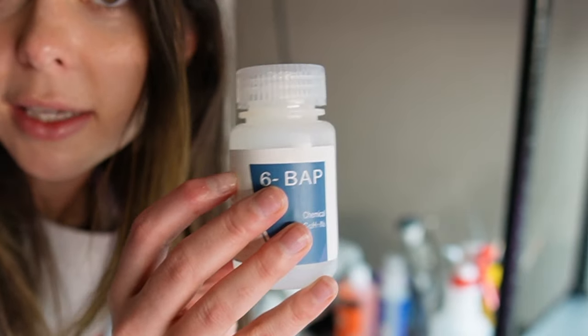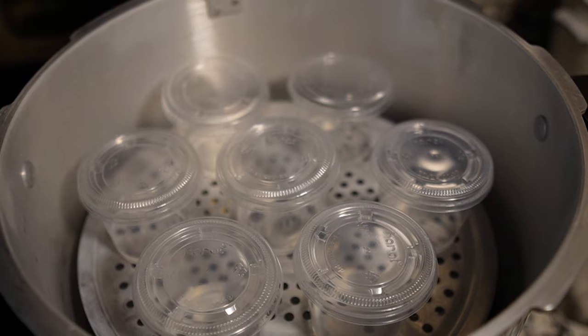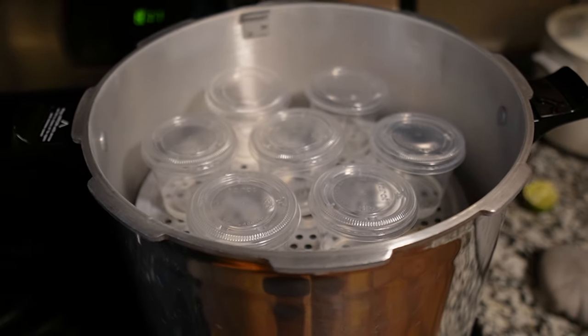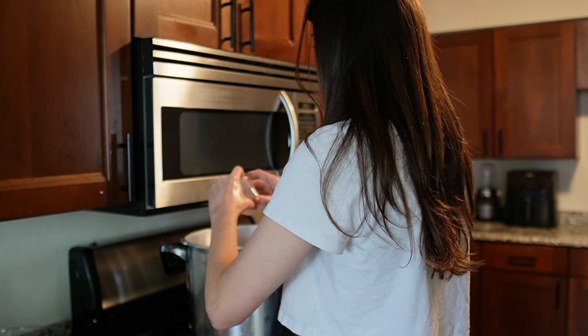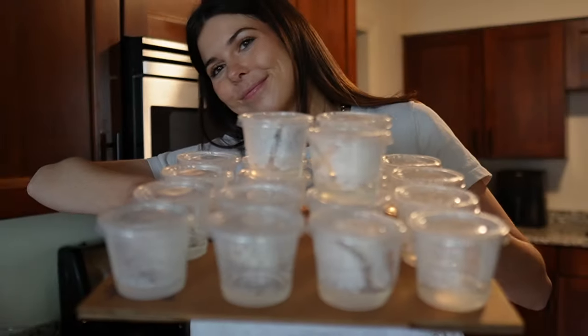This is bootleg science. I already prepared the tissue culture media last night. Right now I'm going to head over to my kitchen and sterilize the forceps and the scissors and paper towels and basically everything that goes underneath the laminar flow hood to get ready to do the transfer later today.